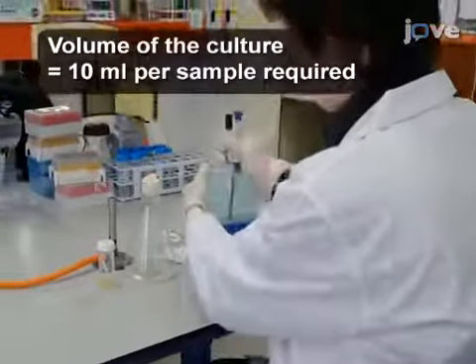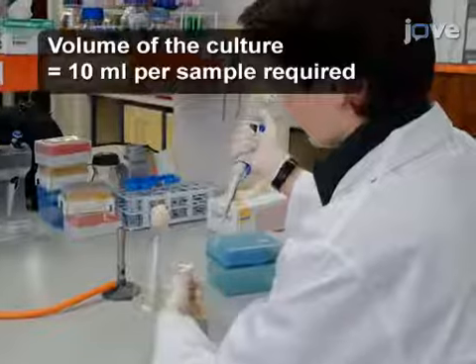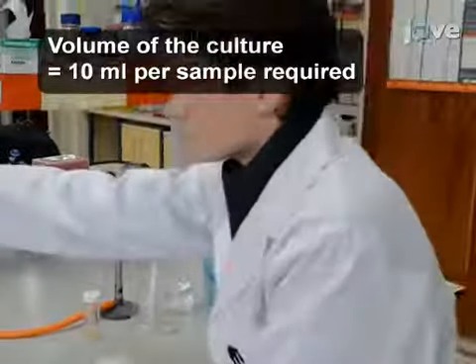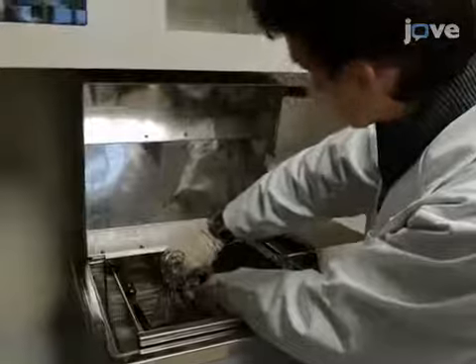Dilute a fresh overnight culture of this E. coli strain to an optical density at 600 nm of 0.01 in a dilute complex medium with antibiotics as required for selection. Grow the culture at 30 degrees Celsius with shaking to an optical density at 600 nm of 0.05 to 0.1.